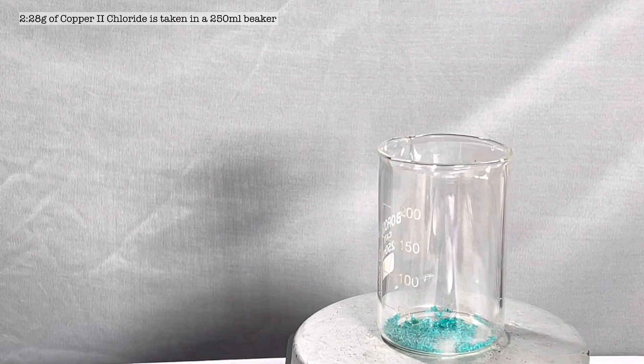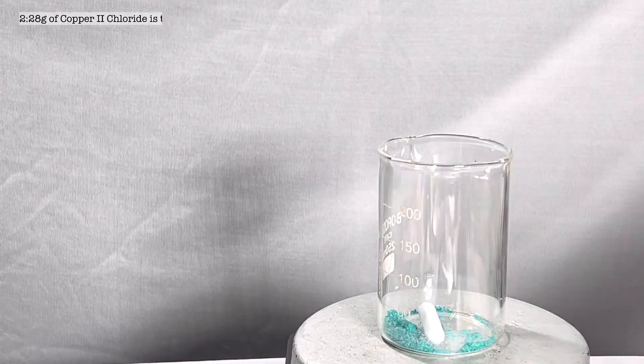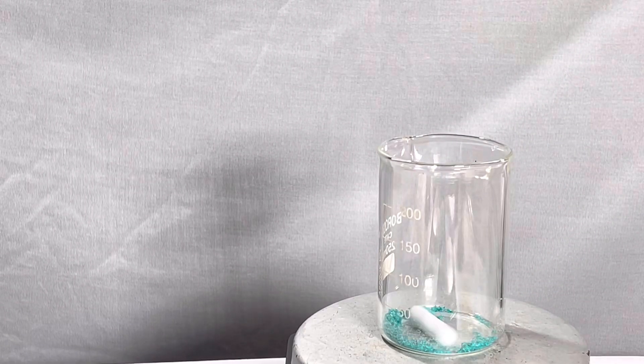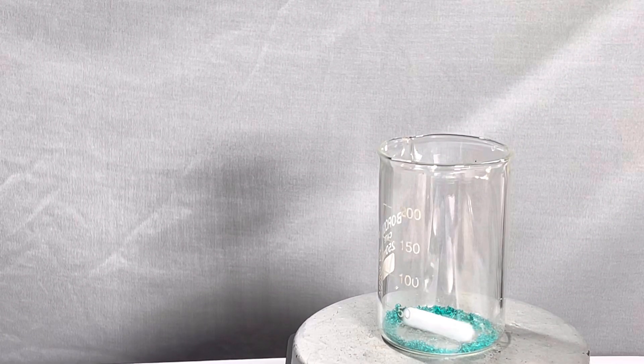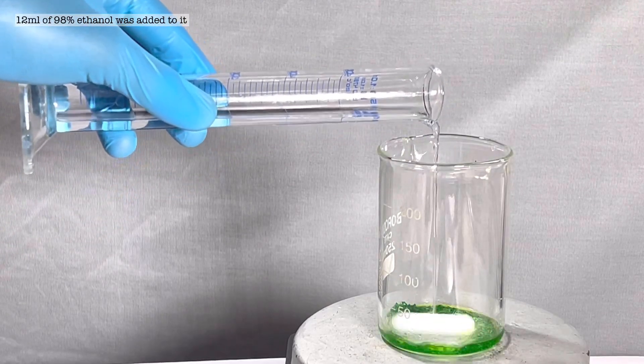Start by taking 2.28 grams of the copper 2 chloride dihydrate in a 250 milliliter beaker. A stirring bar was placed inside and then the stirring was turned on. Next, 12 milliliters of 98% ethanol was added to dissolve the copper chloride in it.